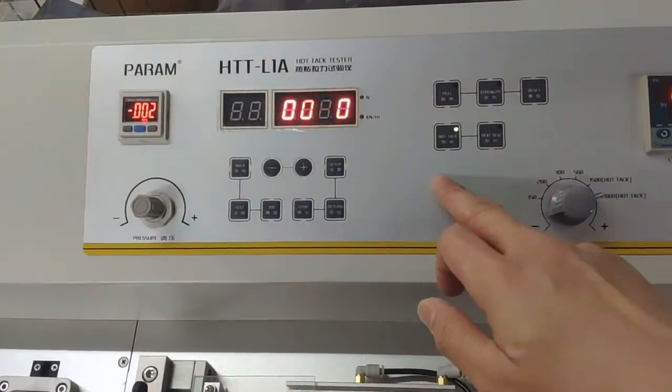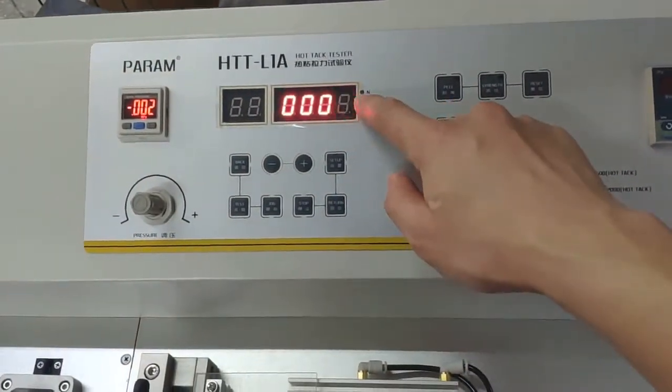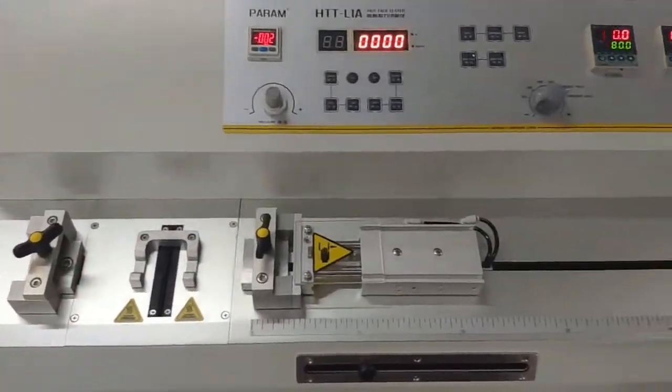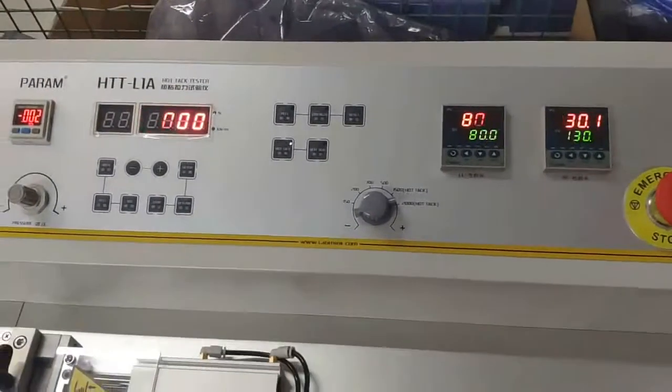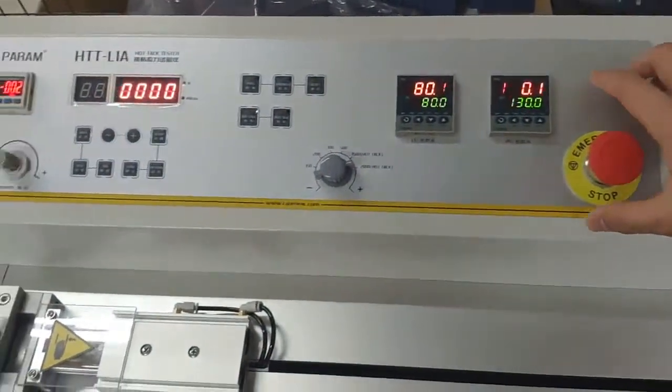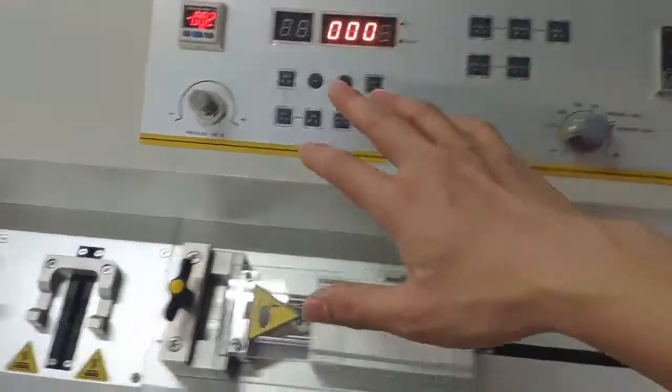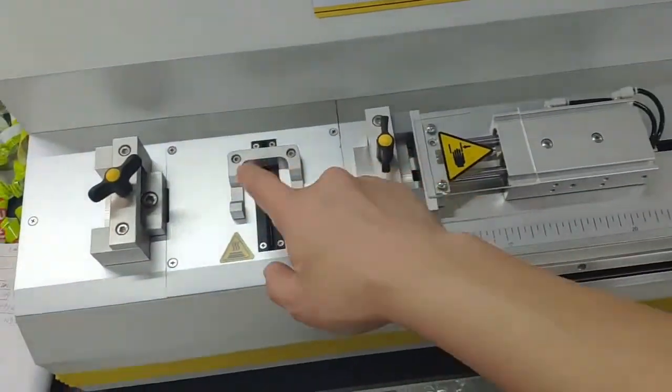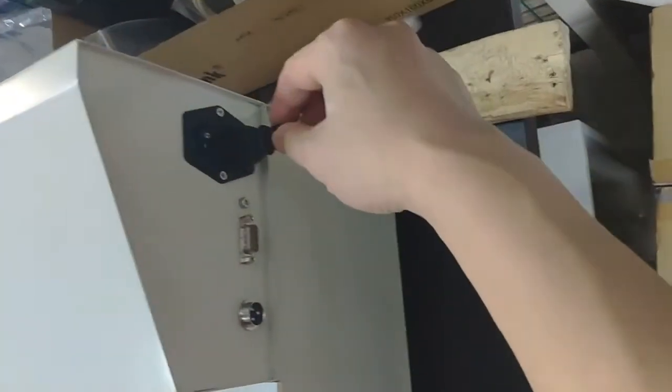This is a Hot Tack Tester HTT-L1A. Let's introduce this instrument. Here is the front panel, and here is the test area with two grips and a sample area. On this side you can see the power cable.